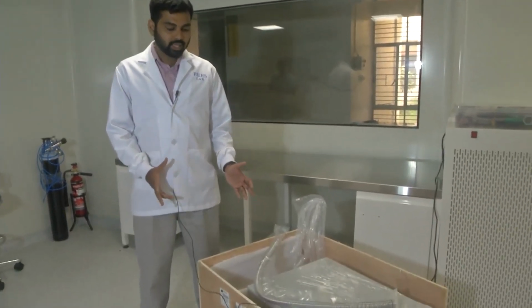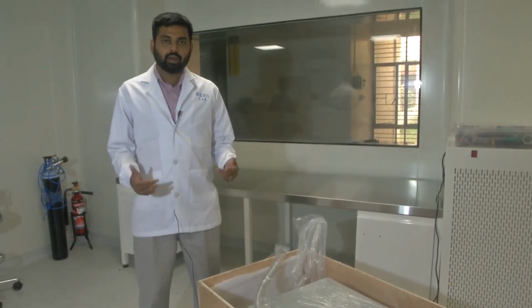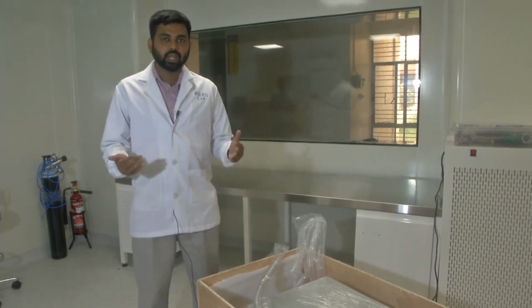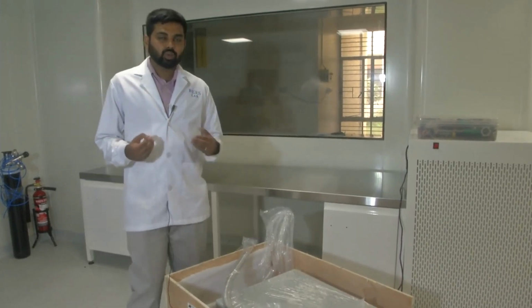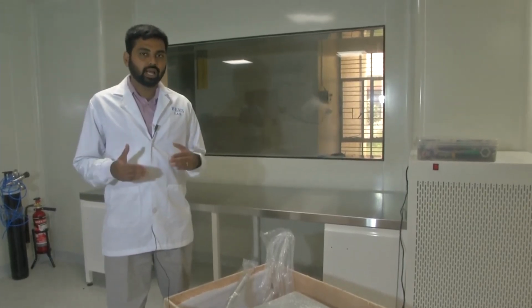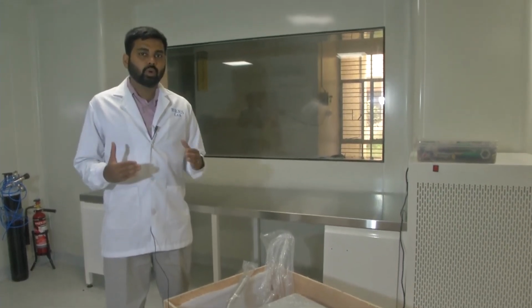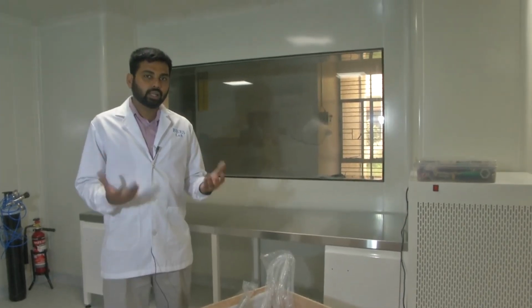So oxygen plasma is a very multi-purpose system that can be used for surface activation, surface cleaning. Let us say you have a substrate or a glass substrate, you want to clean it. So oxygen plasma can be used for that. It is also used for surface enhancement, surface activation, in case you want to coat antibodies or other materials on top of glass. Another important use of oxygen plasma system is to bond PDMS membranes to the glass substrate.